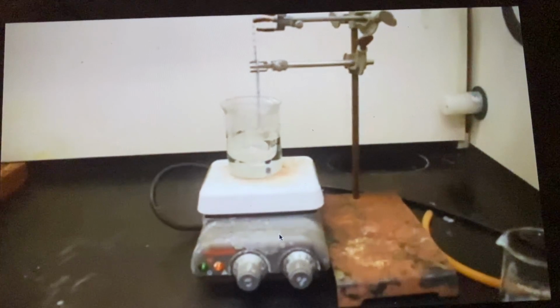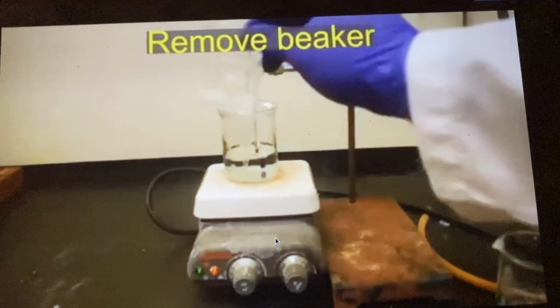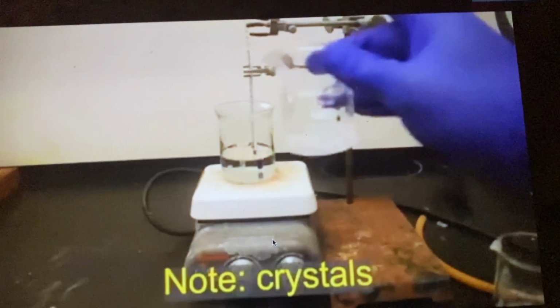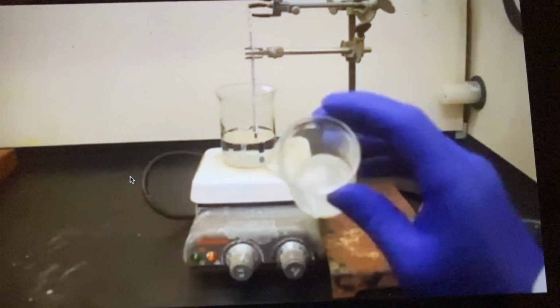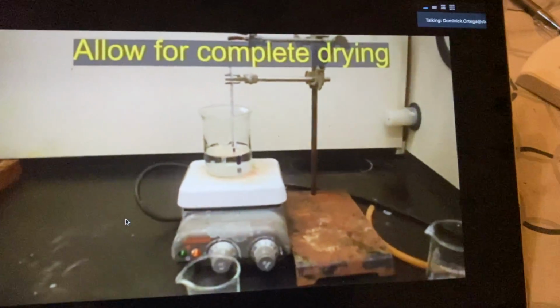So I think you'll see the slushy-like crystals here. It's very wet, but you still have crystals that form. So you have to completely dry it. Here it skips the vacuum filtration. That's what you would have done to dry it.